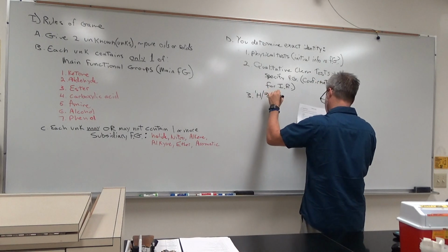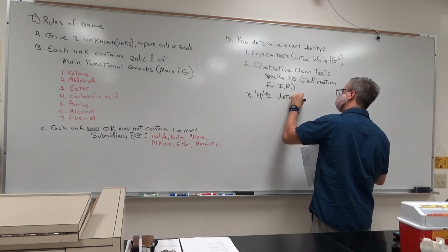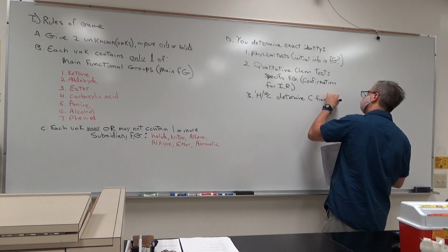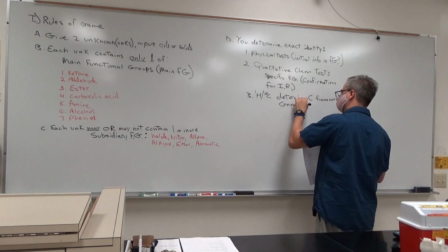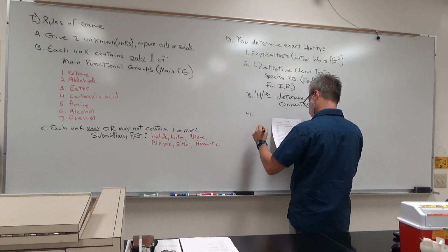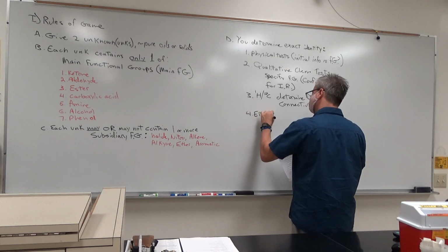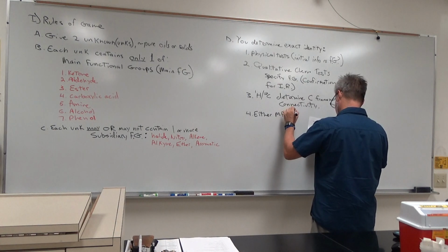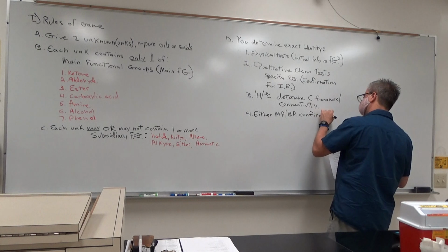Proton and C13 NMR can help you determine your carbon framework, or connectivity, just another word for it. And either your melting point or boiling point helps you confirm identity.